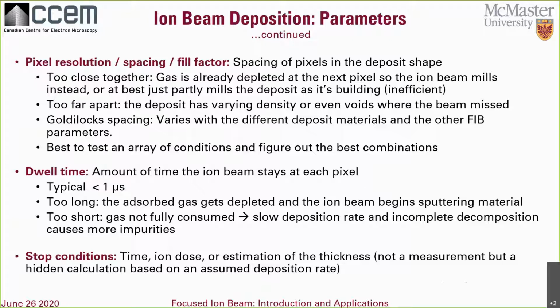And again, material dependent, but you just hit a target brightness with a voltage that you use regularly, and you'll get a feel for it. But very heavily material dependent: heavy metals like steel do not get as bright as lighter elements like silicon, aluminum, or carbon, even at the same thickness. So you have to be mindful of the material you're using as well.